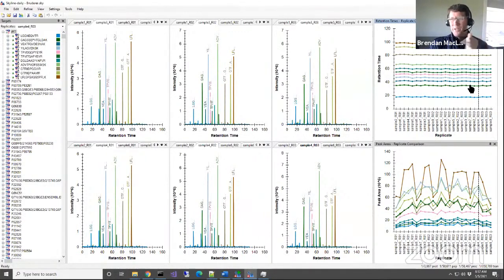Something goes wrong, we start losing subjects, which are actually way more valuable than the technical replicates, Olga will tell you. So when you do this kind of replicate experiment, you want to do a full replicate of each thing, and that is blocking. It's one method of blocking. There are other things that Olga will talk about next week.